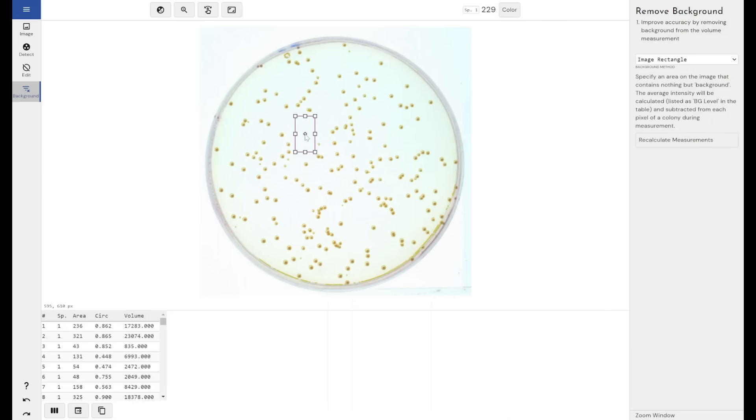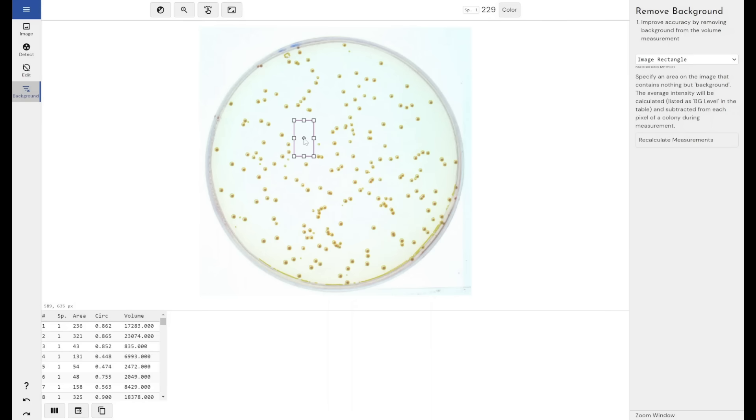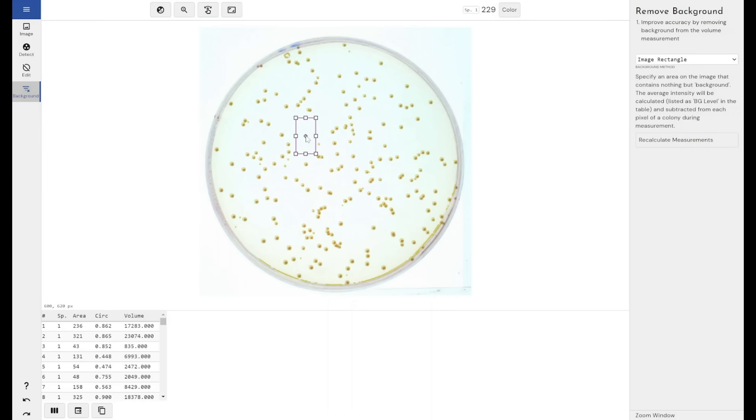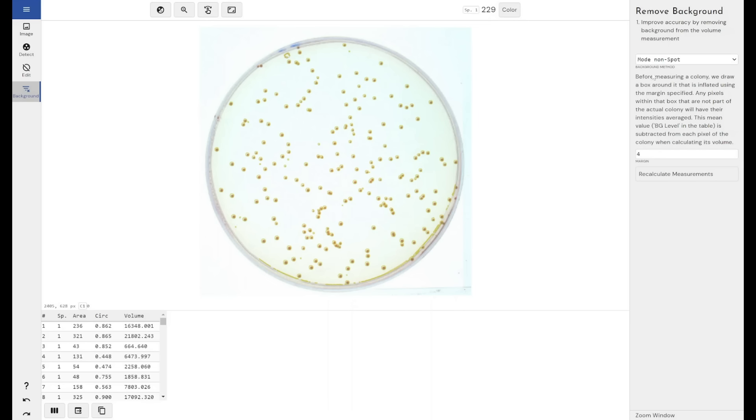It's extremely useful and accurate for images such as this where there's quite a uniform background. It's not as useful in images where the background changes quite a lot because obviously the average value here for background will be quite different from the average value here where it's darker. But it is quite good in this image.